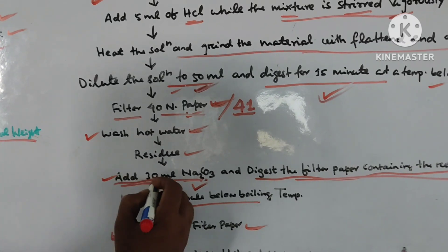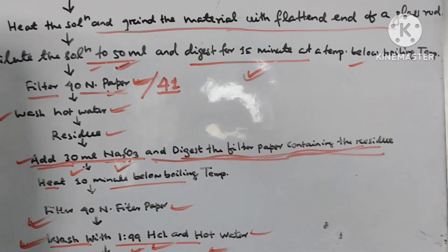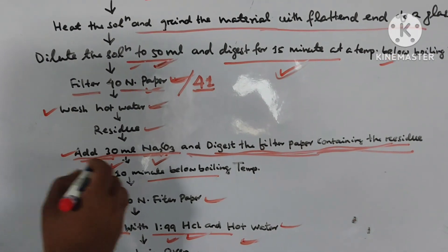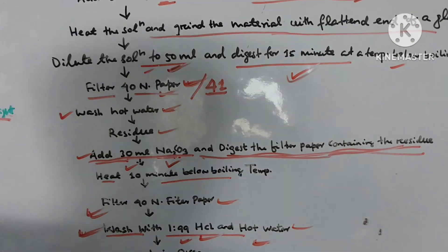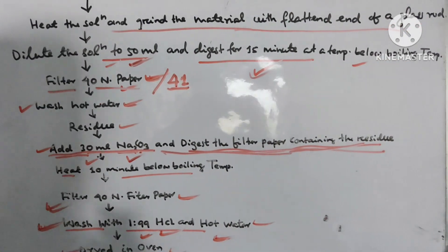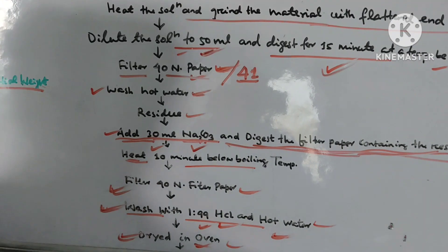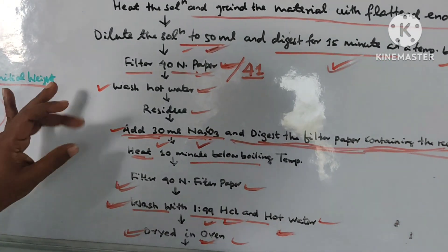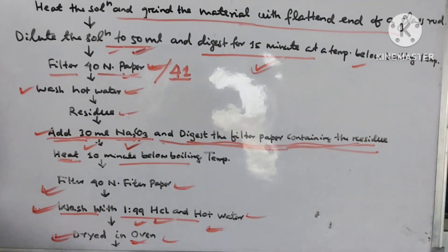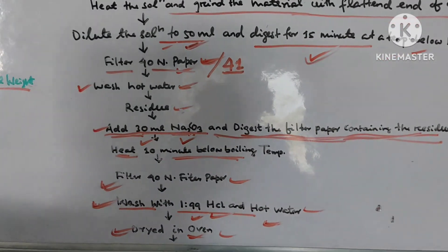Wash with hot water and collect the residue part in another beaker. Add 30 ml of sodium carbonate and digest the filter paper containing the residue. Collect the residue part, transfer it to another beaker, add 30 ml of sodium carbonate, and heat it for 10 minutes below boiling temperature.